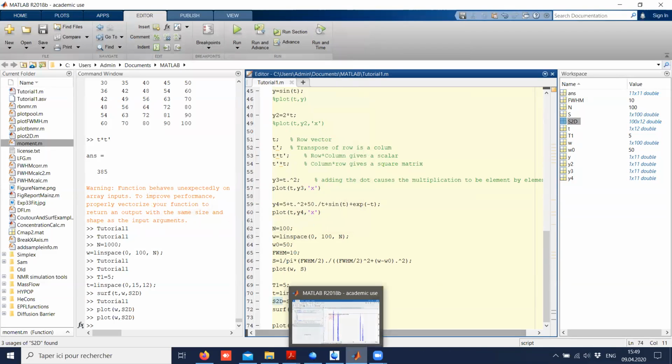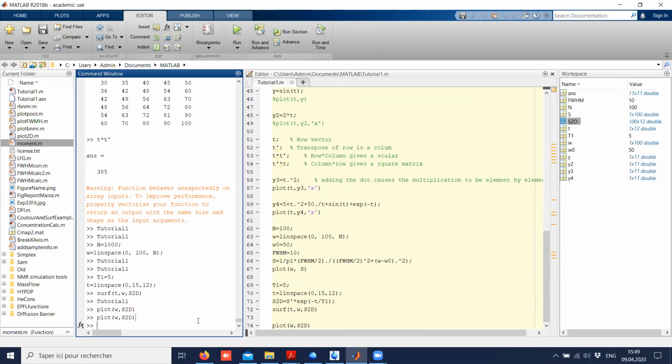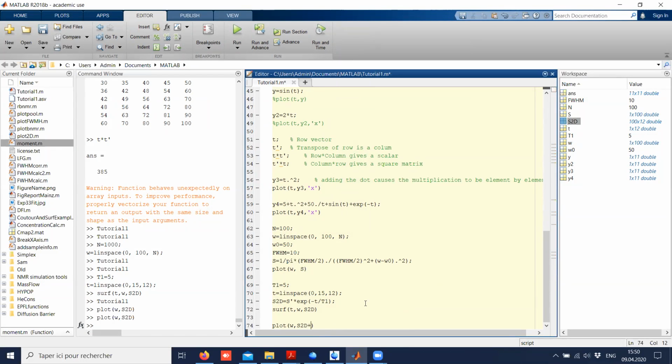So what I can do, this will be a bit more tricky to explain. Yeah, if it's too tricky for the tutorial, we can look at it afterwards. That's not a problem. Yeah, because in fact, if I just take this and I sum from 1 to how many I have, 12. 0, let's say 0 to 11. But let me just try it.